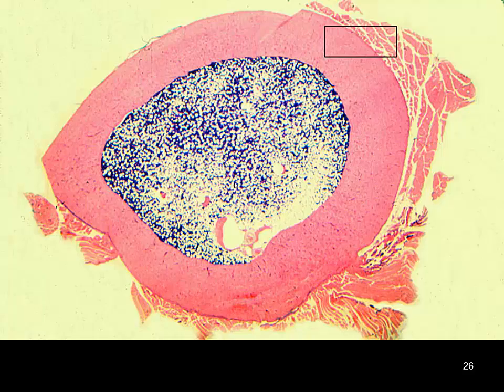Again, looking at a section through bone, compact bone on the outside, large marrow cavity, and these bones can have differing sizes of marrow cavities, different thicknesses of the compact bone, depending upon what the pressures have been subjected to in that particular organism. And again, these are remodeled throughout the life of the organism.